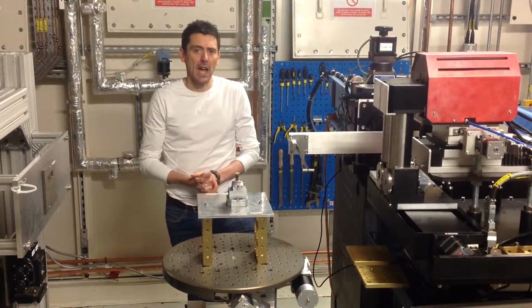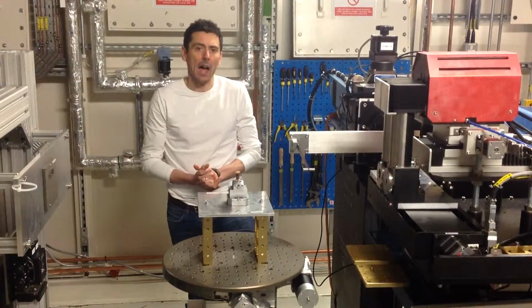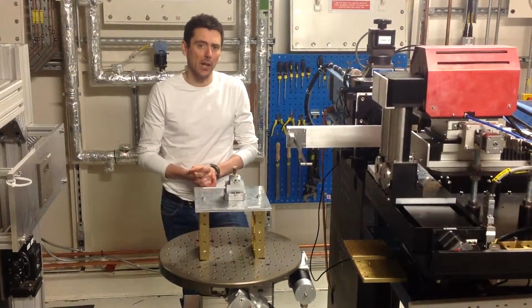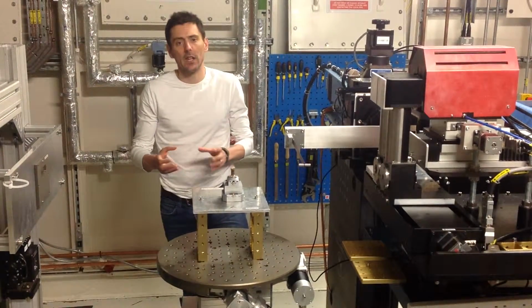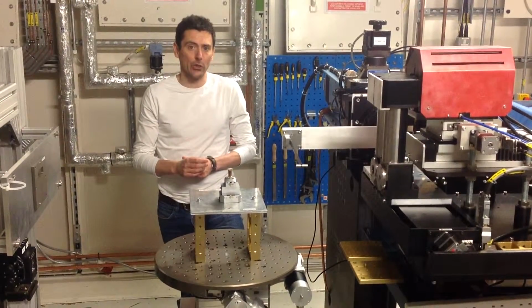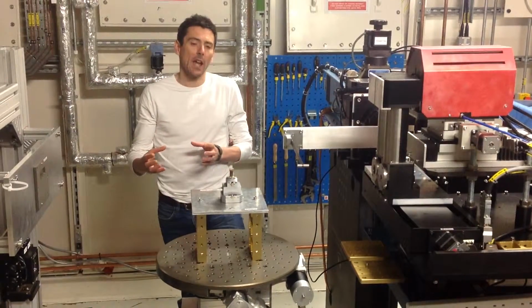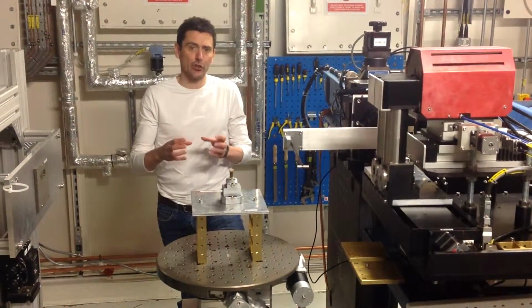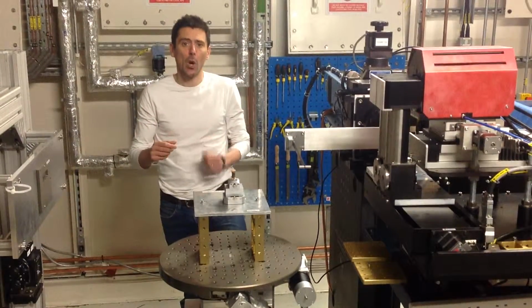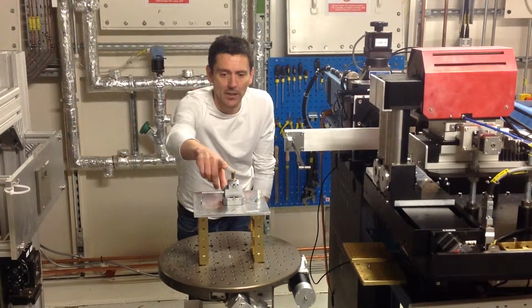I'm standing in an experimental hutch at the Diamond Light Source at Harwell. And I'm just going to tell you a little bit about an experiment that myself and colleagues have been doing here. We're studying the spatial distribution of organic carbon in the soil. And that's important because we're trying to understand how the carbon in the soil is distributed spatially within the 3D structure of the soil.